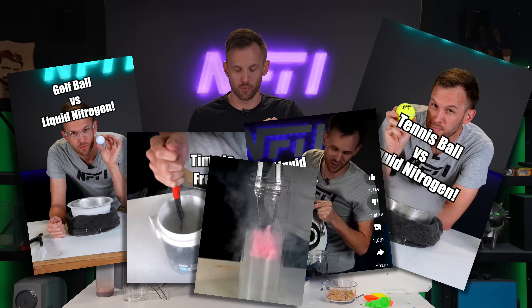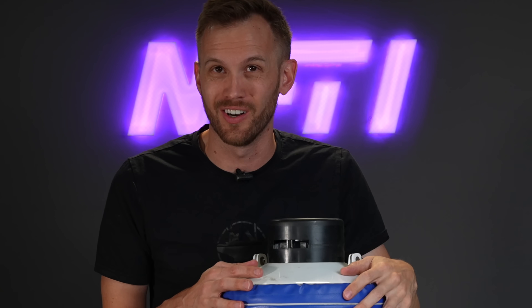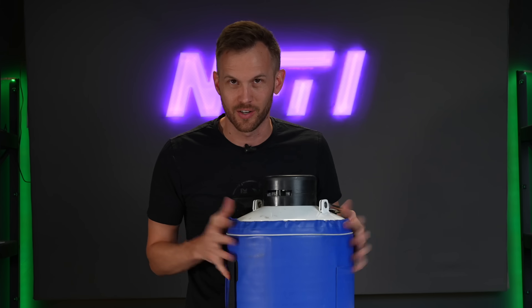Over the years, I have done dozens of experiments with liquid nitrogen — experiments, demonstrations, and projects. And if you've seen any of those, then you've probably seen me use a container that looks very much like this. Today, we're going to take a look inside this container and find out what does it take to keep liquid nitrogen cold.